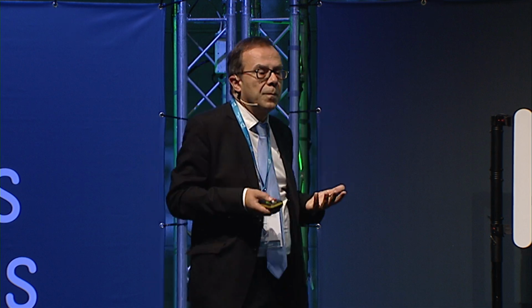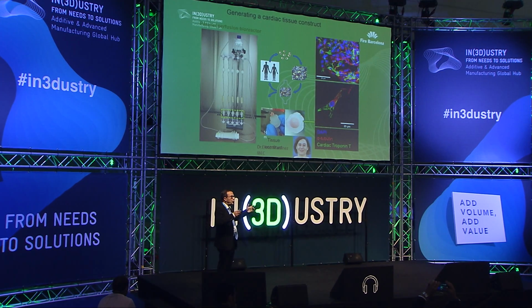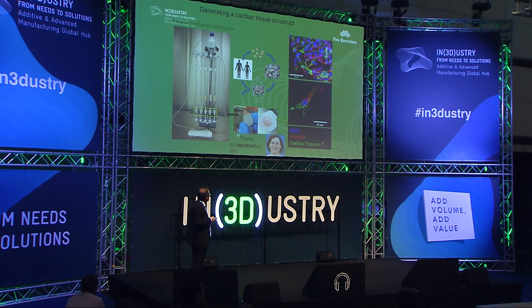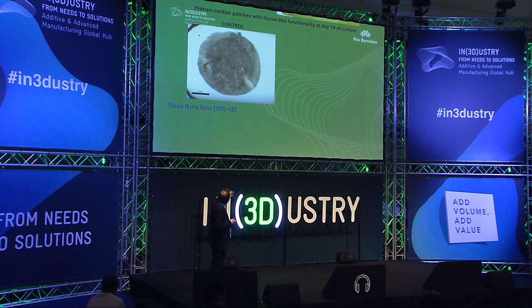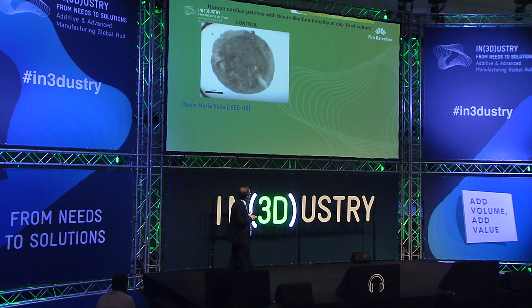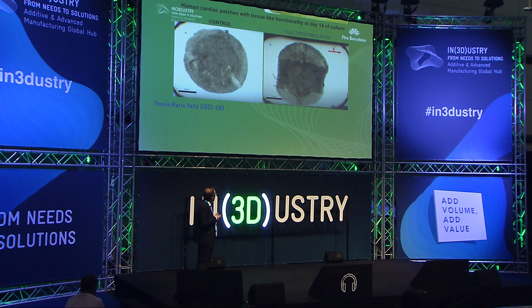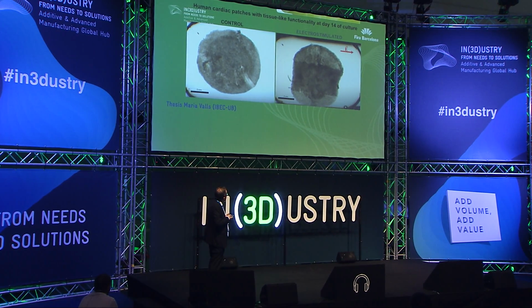After, you need also to develop 3D bioreactors, where you introduce the 3D printed tissue inside the bioreactors in order to stimulate the culture and produce the differentiation of the tissue. And using this system, it is possible. This is the control of the 3D tissue obtained after the differentiation of cardiac iPS. But if you work right, you arrive to obtain this type of system after the electrostimulation inside of the bioincubator. So it is possible to observe the strong contraction, the maturity of the 3D patch, in this case, of the system.